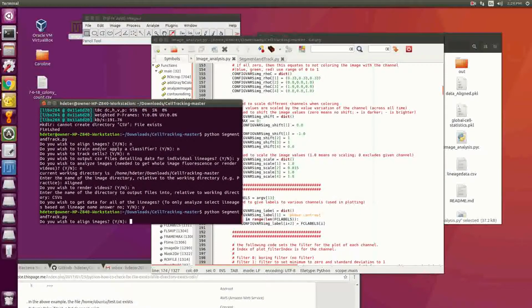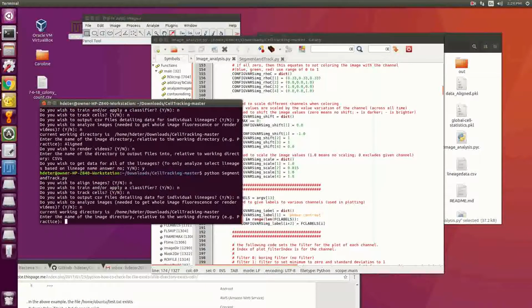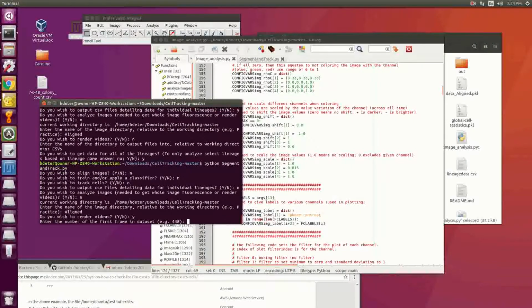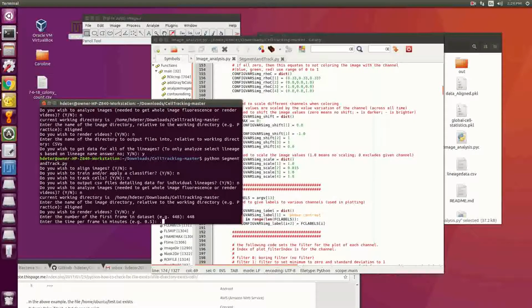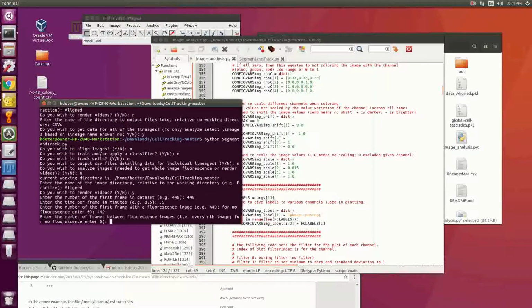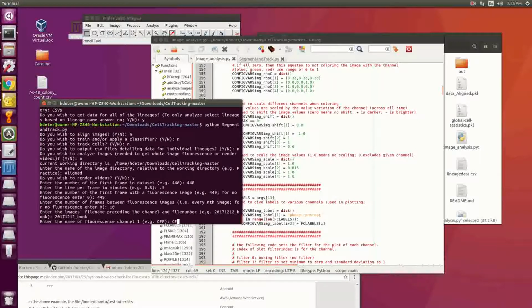This time I just answer no, no, one, yes, and then enter the values. And that's it, we're in mCherry. And do I have masks?